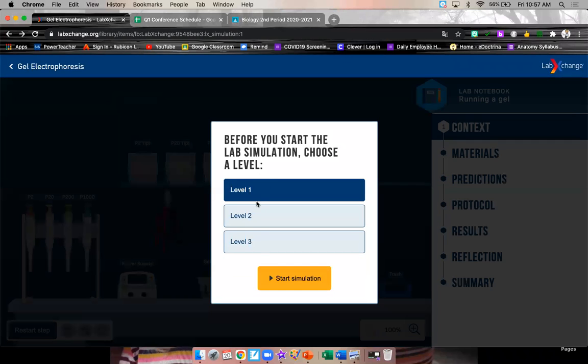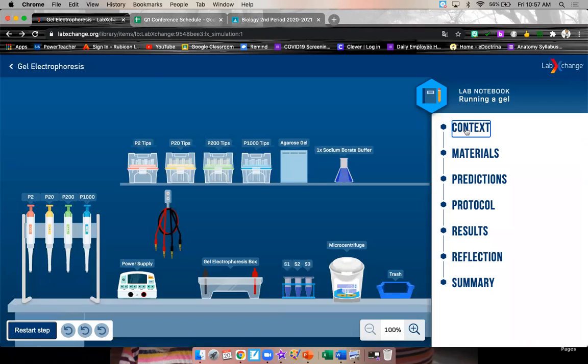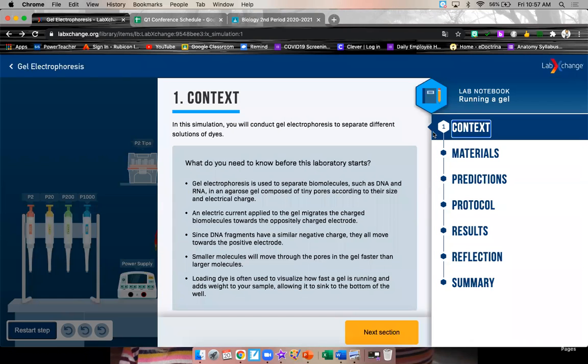Now I've not noticed a difference between the different levels. I've run this a couple times. So let's just pick number one and move on and get a little context what's going on here.